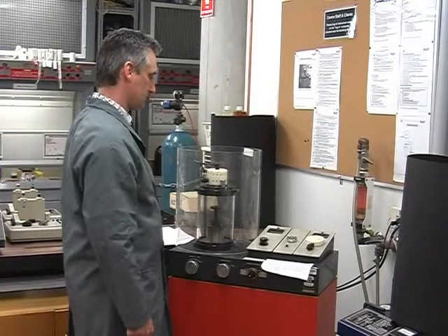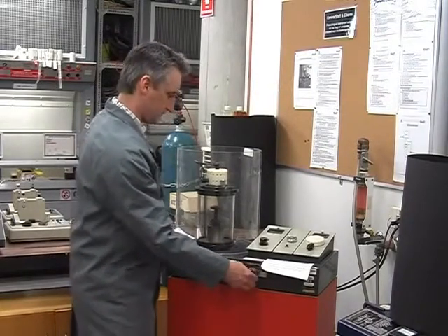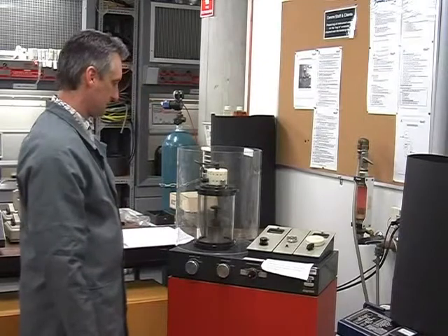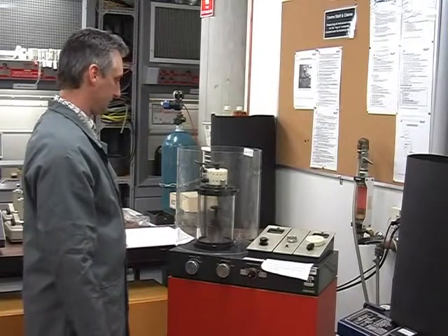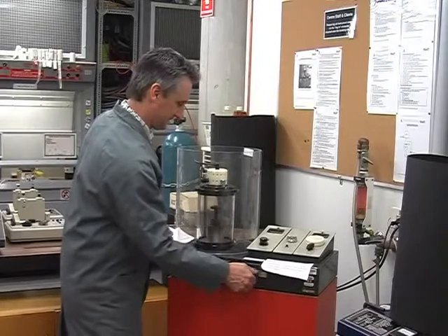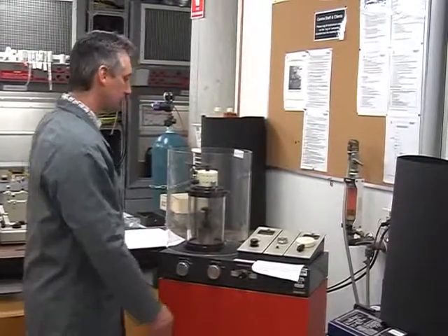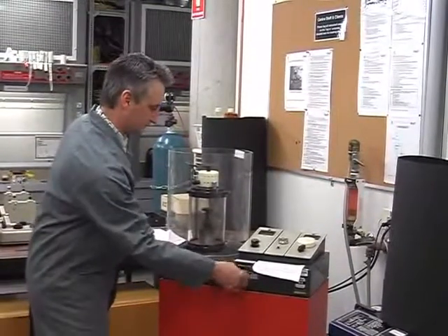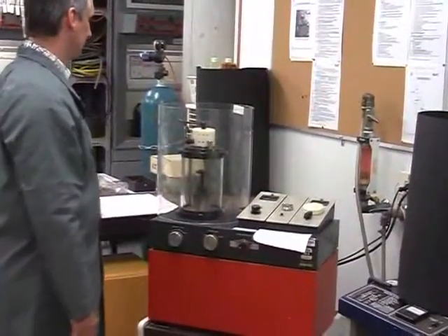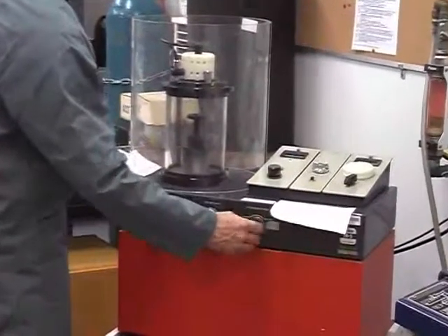Repeat the flushing procedure another two times to ensure that as much of the air as possible is removed from the chamber and replaced with high purity argon. Remember at all times to be extremely gentle with the needle valve and do not over-tighten it. After the final flush, close the needle valve and wait for the vacuum gauge to read less than 0.1 torr.